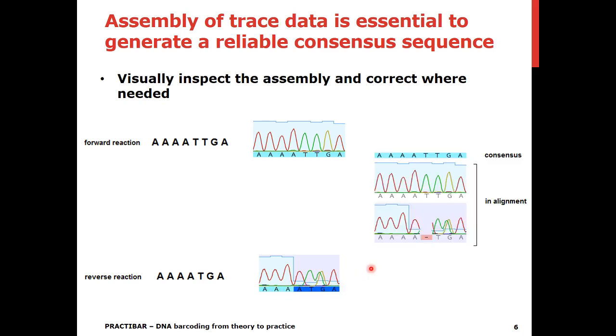So if we would align that, then actually we could see, okay, these 4 A's align, one of the T's align as well, but actually looking at these double T's here and these double T's there and this G and A, we can come to a consensus sequence of 4 A's, the 2 T's, and G and A.